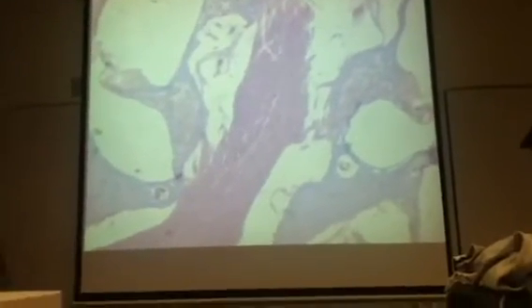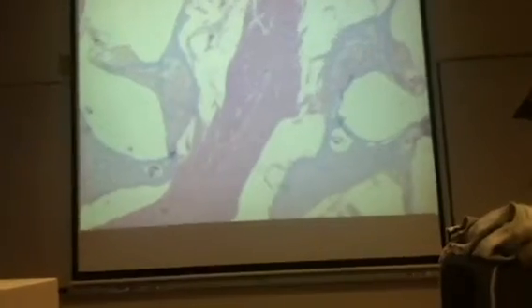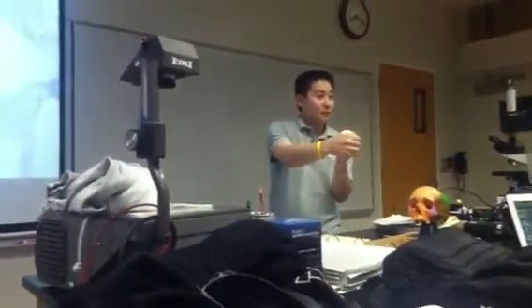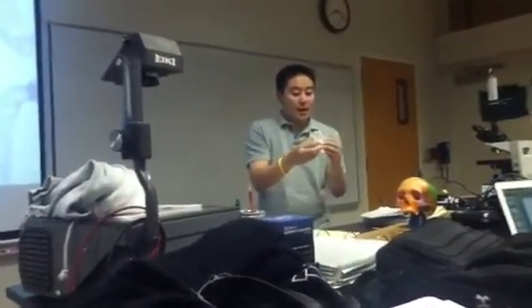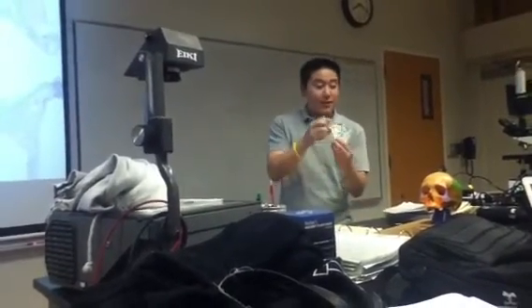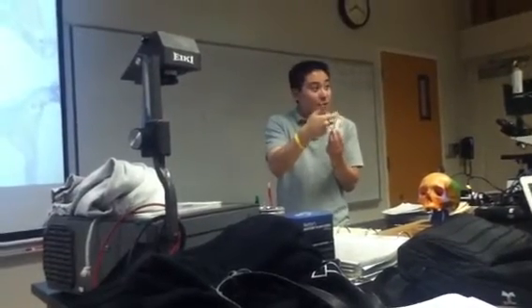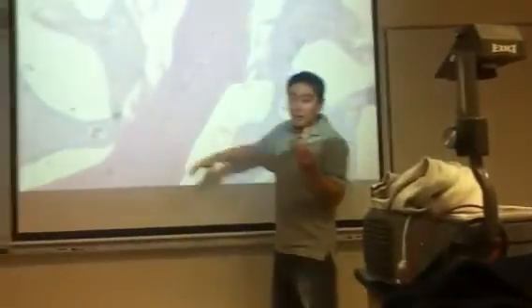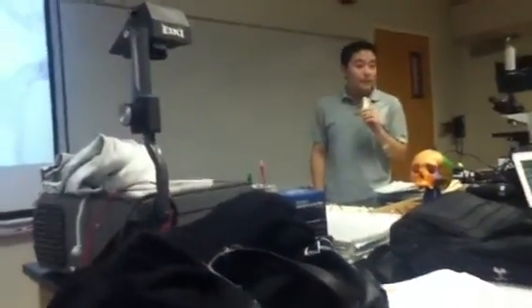So the cochlea is that snail-like structure. It's a long tube that spirals around. So what this cross-section is — they've taken essentially this model, cut the cochlea in half like this, and opened it up. Now for this slide, they're using essentially this. It's the same thing right here. This middle area — this dense pink area — is what structure?